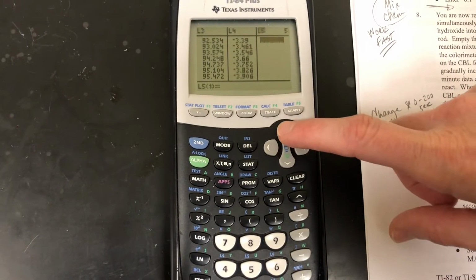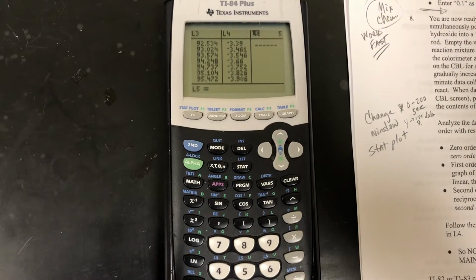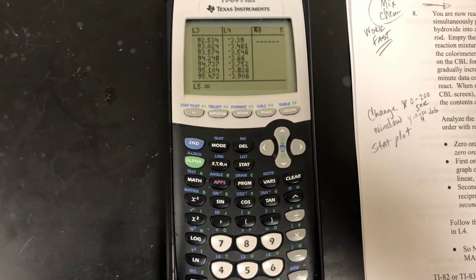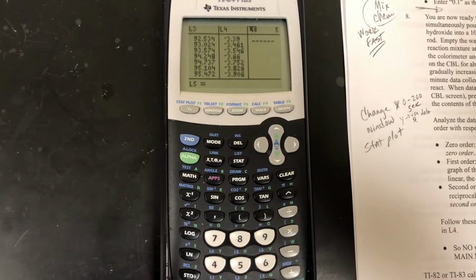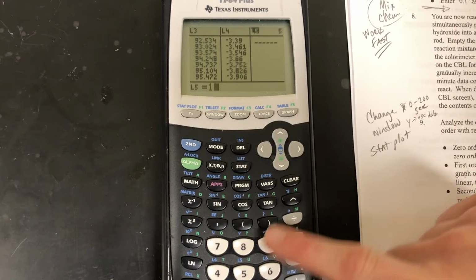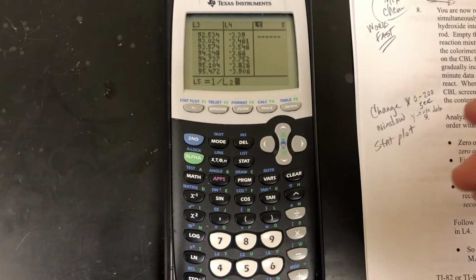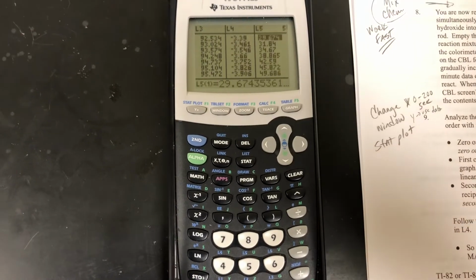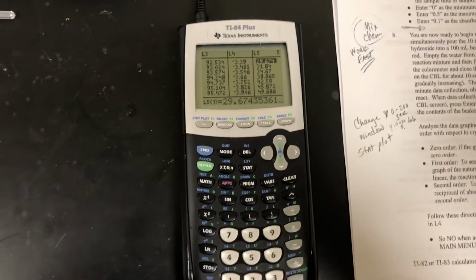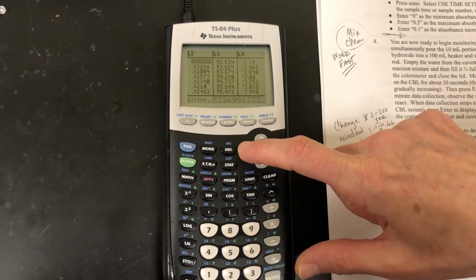Okay, and then last but not least, for L5, we know with a 2nd order reaction, 1 over the concentration compared to the time is going to be linear. So here we're going to do 1 divided by, and again, second 2, which is L2, and hit enter, and then it'll immediately take all of our L2 data and divide it into 1. Okay, now we have all the data in here. Now we need to plot it.